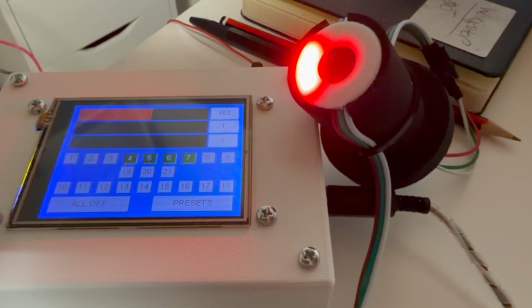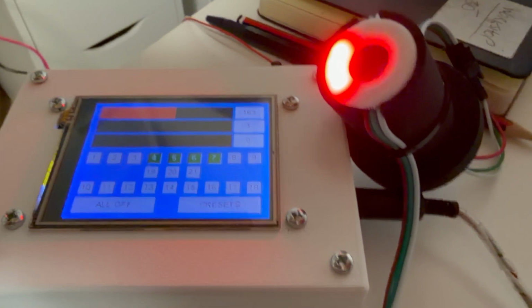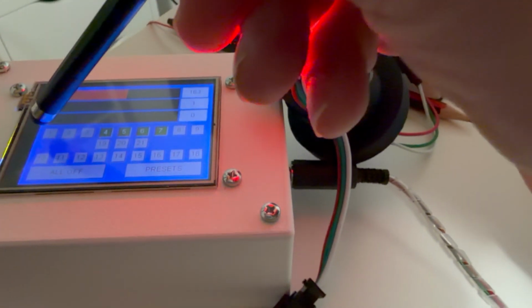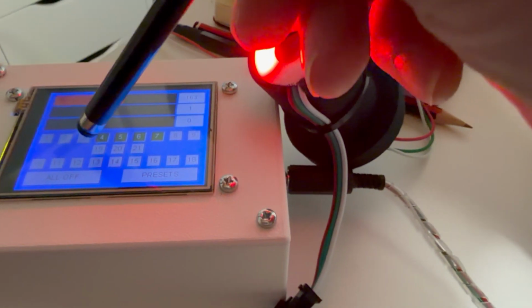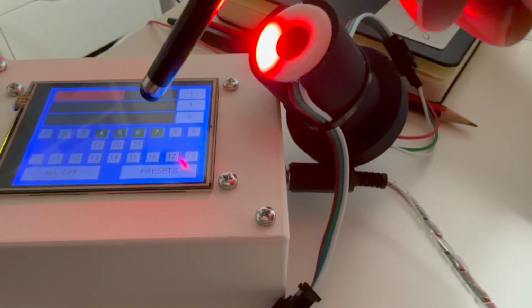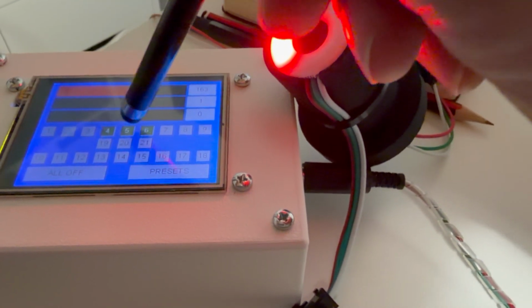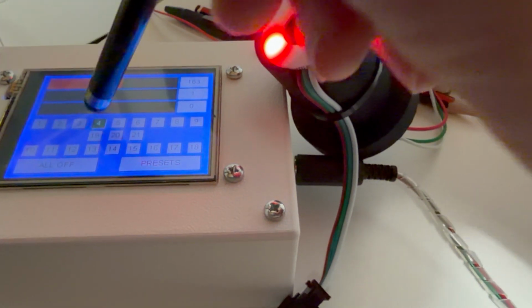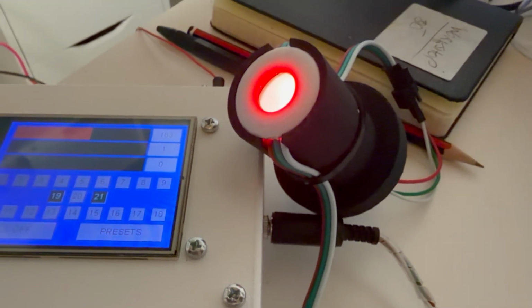One can also set the central region. So if you wanted to set Rheinberg, you'd set perhaps all of the outer set. This is the left set in the outer ring. This is the right set in the outer ring. And the middle group of 3 here are the central pixels. So let's just turn off the outer ring and turn on the inner one. So now they've come up as red on the inside.